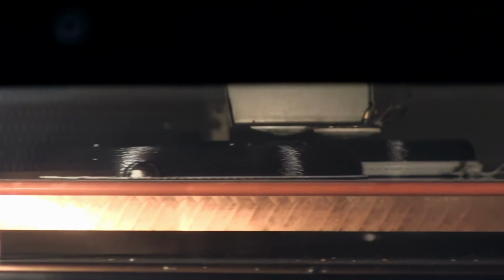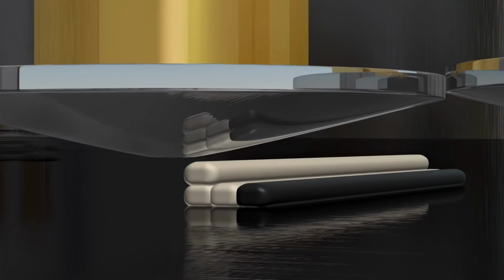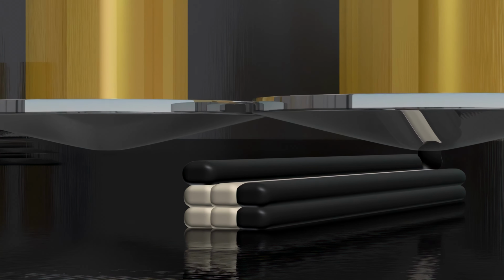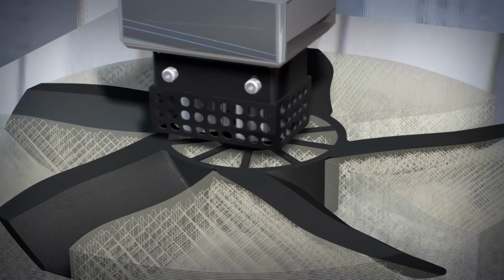Notably, our facility specializes in two cutting-edge technologies: extrusion deposition and light polymerization. Extrusion deposition is a technique where material is selectively deposited through a nozzle, building objects from the ground up, one layer at a time. We use thermoplastics that are heated to a specific transition temperature for extrusion, as well as hydrogels that maintain their shape post-extrusion.